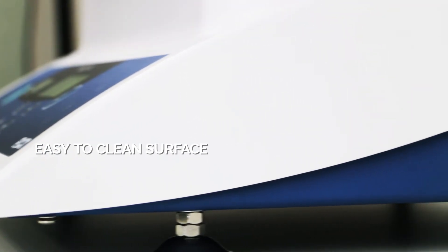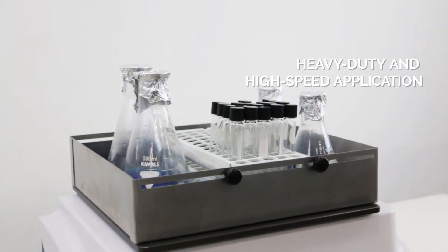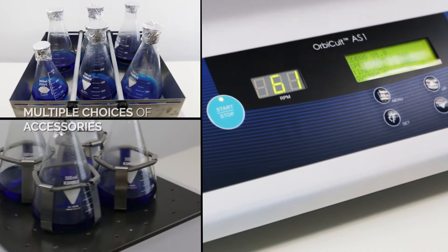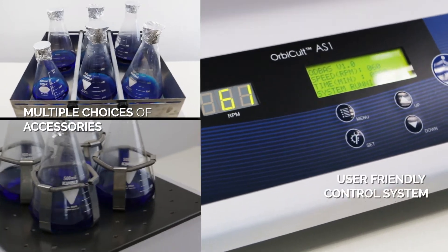Provided with easy-to-clean surface, heavy-duty and high-speed application, multiple choices of accessories and user-friendly control system.